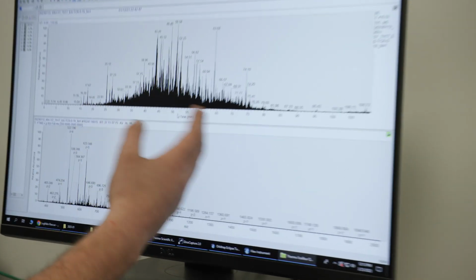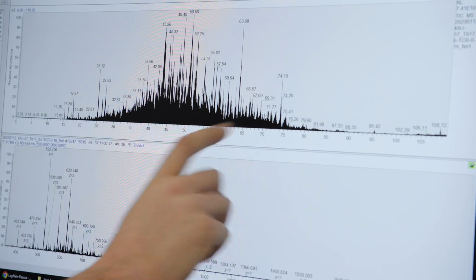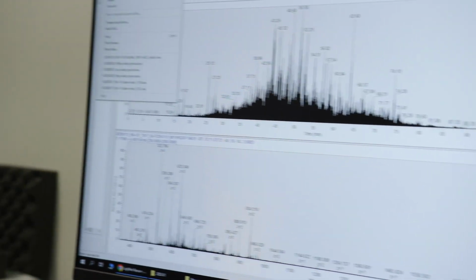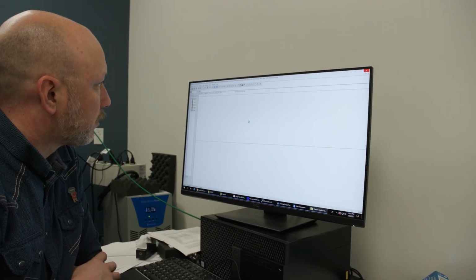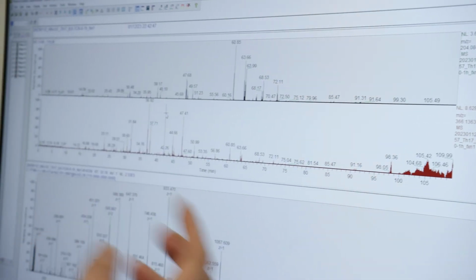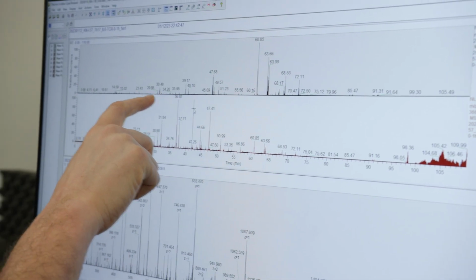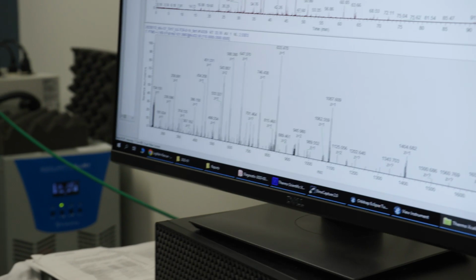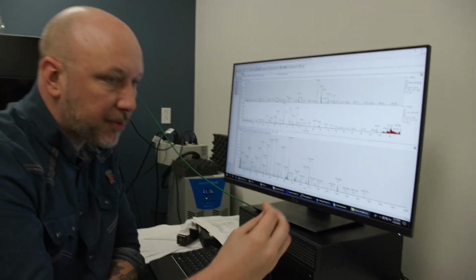Okay, so this is a sample that wasn't enriched for glycopeptides, okay? And you can see we still see a lot of ion current. We still see the instrument working hard. If we ask it to look for evidence of glycopeptides, we don't see a lot of peaks, right? There are always some abundant glycopeptides in your sample, but you can see these valleys here where there's nothing going on, okay?